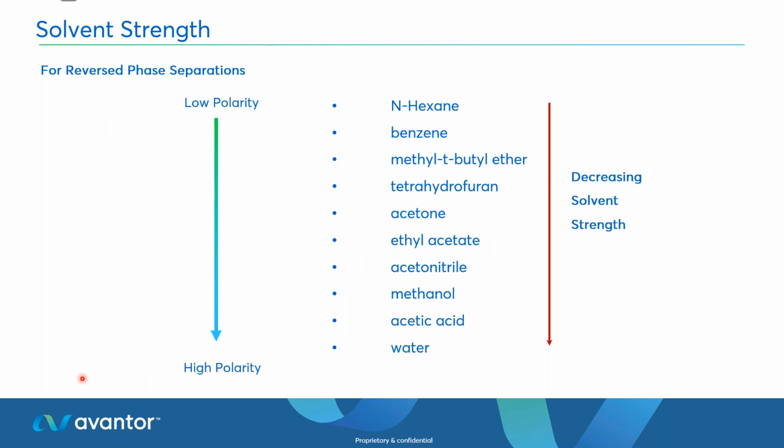When we look at the solvent strength, you can see they also have a different strength. So for example, if I want to run the same method with acetonitrile and switch it to methanol, I have to use a different percentage. However, you'd think that was a nice switch. We just do 10% more. Doesn't quite work out that way because of those differing interactions.